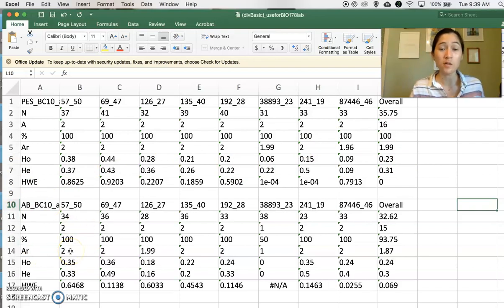And if we remember first, we're looking at the allelic related metrics compared to that example data set. How does our data differ and why might that be? Think about what types of marker we were using compared to what type of marker they were using. So in this video, I'm going to point you in some directions similar to what the written instructions say about what I want you to think about.